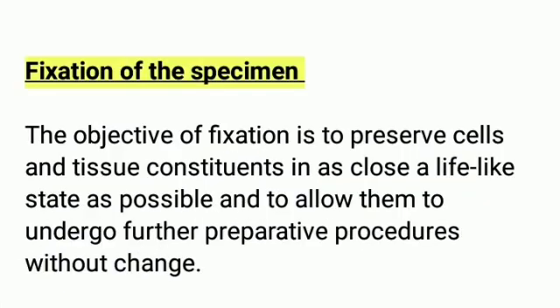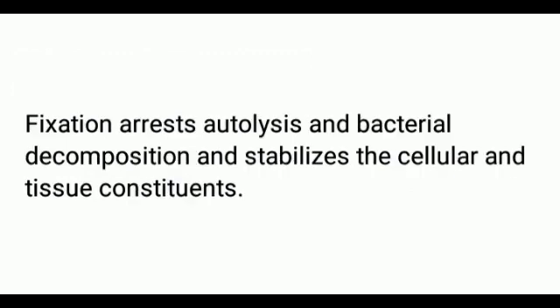Fixation of the specimen. The objective of fixation is to preserve cells and tissue constituents in as close a lifelike state as possible and to allow them to undergo further preparative procedures without change. Fixation arrests autolysis and bacterial decomposition and stabilizes the cellular and tissue constituents.